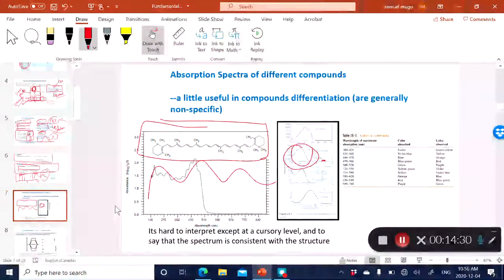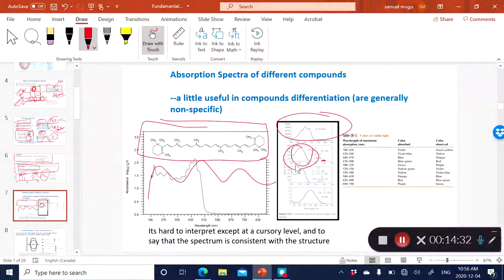On the other hand, compared to beta carotene, you can see I've got a much bigger band, because there are so many different possible transitions. Look at acetone, for example. It can only absorb within a very narrow range, 230 to about 300 nanometers in the UV range, because as you can see, it doesn't have many possible transitions because it's a very small molecule.